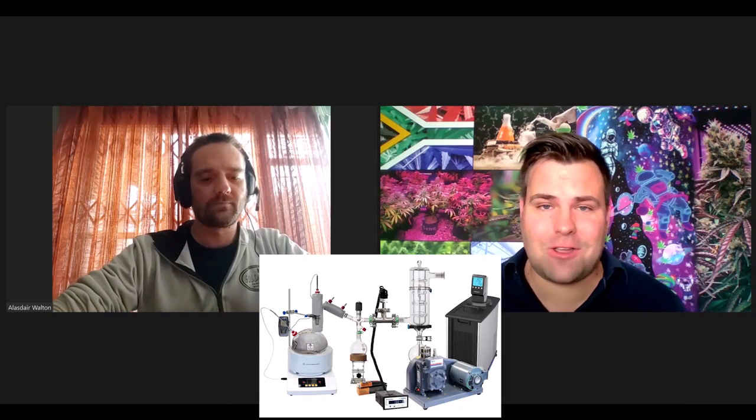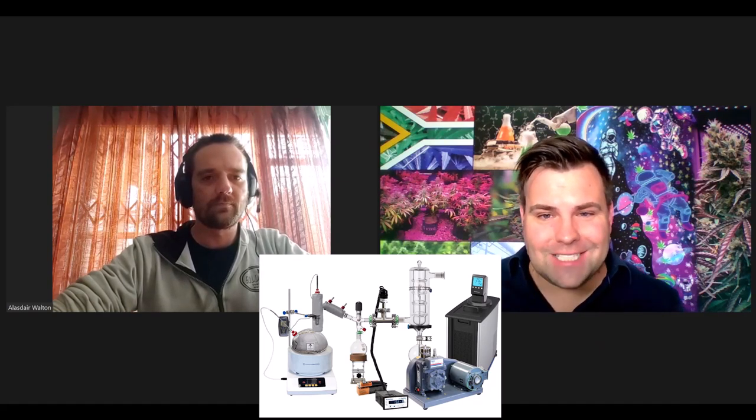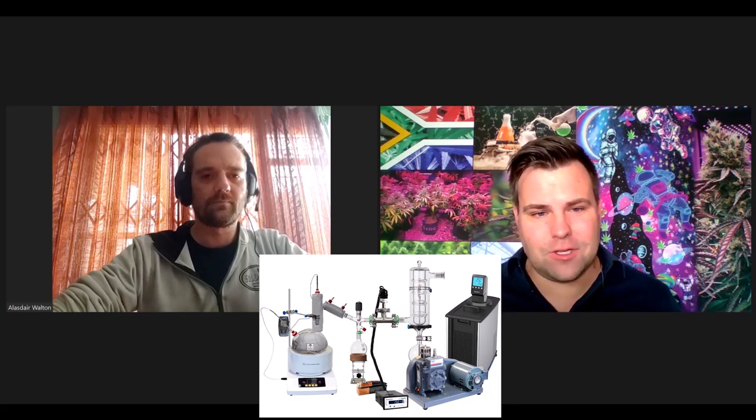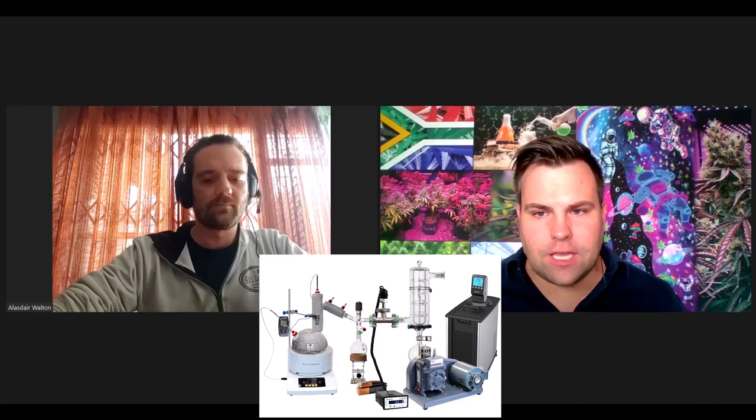Today, we're going to tackle quite a niche topic in extraction, which is short path distillation, or SPD as it's commonly known. And I'm going to share an image later on to show everyone what SPD is, but I'll pop an image on quickly for the video as well. So in this space, Al, you've been quite active in terms of taking not just crude oil and those extractions, but now refining it, essentially increasing the purity of those cannabinoids from maybe, let's say you've got a 60% crude to a 90% oil. Can you take us through, for starters, what is SPD and what is some of the initial preparation that goes to that crude?